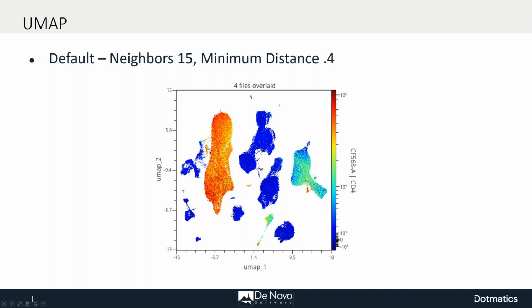And so if you end up with a confusing result and you're like, wait a second, my PI is going to sit down and be like, but what's this? And why is it here? And why is this island so close to that island? Feel free to rerun the seed. You'll get the same populations in the same islands. The islands will very likely, though, be in a different orientation to each other. And again, because UMAP is nonlinear, that's okay. That's not the important part of the information. The important part is what events are inside and what events are in separate islands.